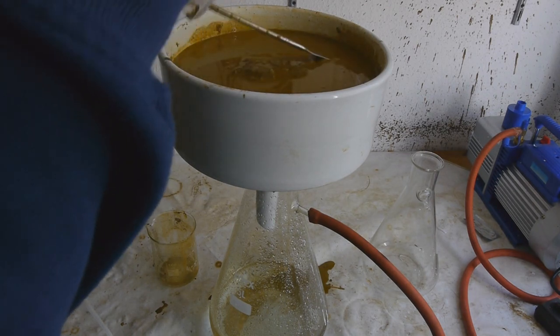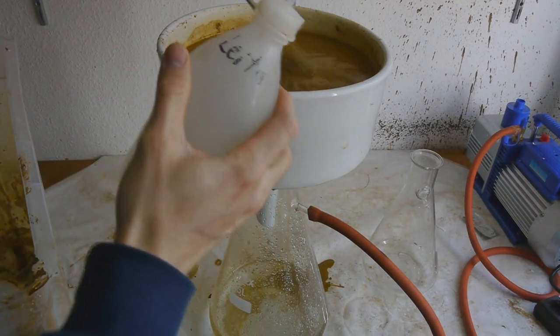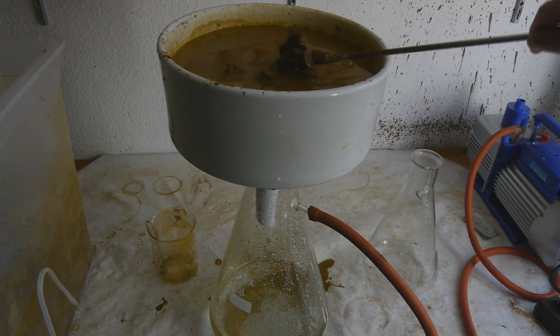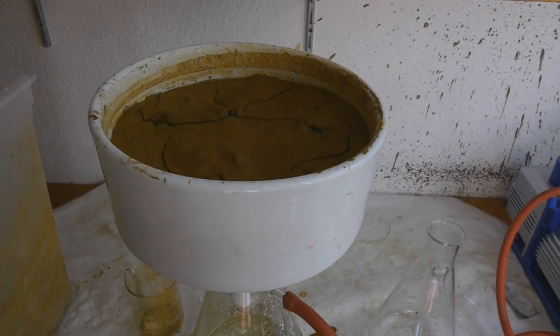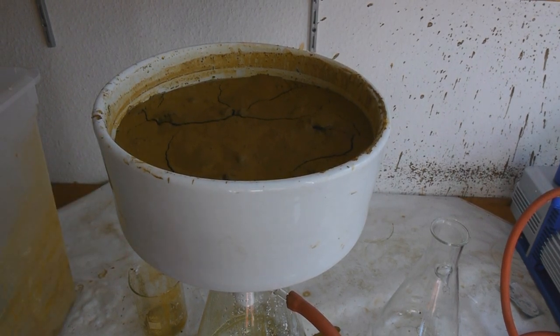Oh, whoops. Dang it. This is the biggest royal mess ever. Stirring this up a little bit is of course also important so it gets washed properly. Okay, as you can see we are making progress. It's already dried up quite a bit 2 hours later.